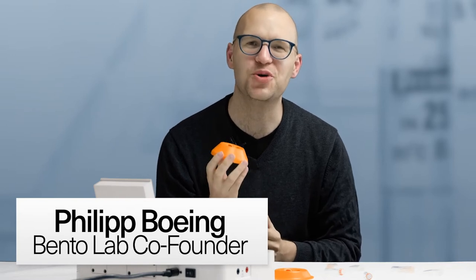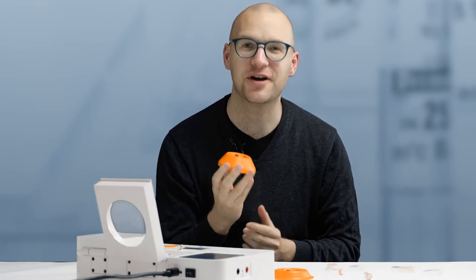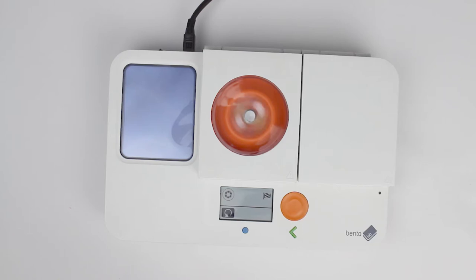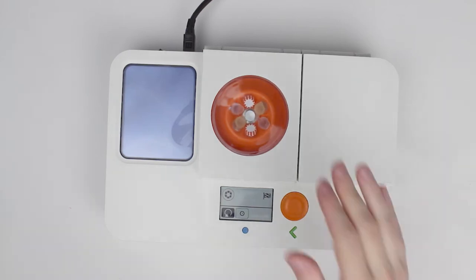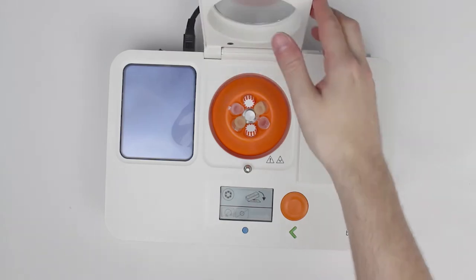Hi, I'm excited to show you our brand new 2 milliliter centrifuge rotor for Bentolab Pro. This is our first updated rotor design since the release of this Bentolab version.